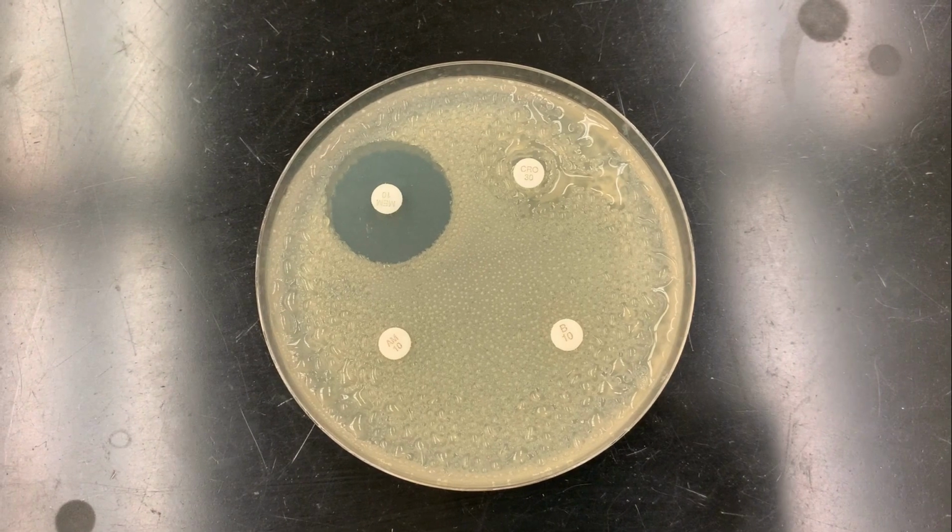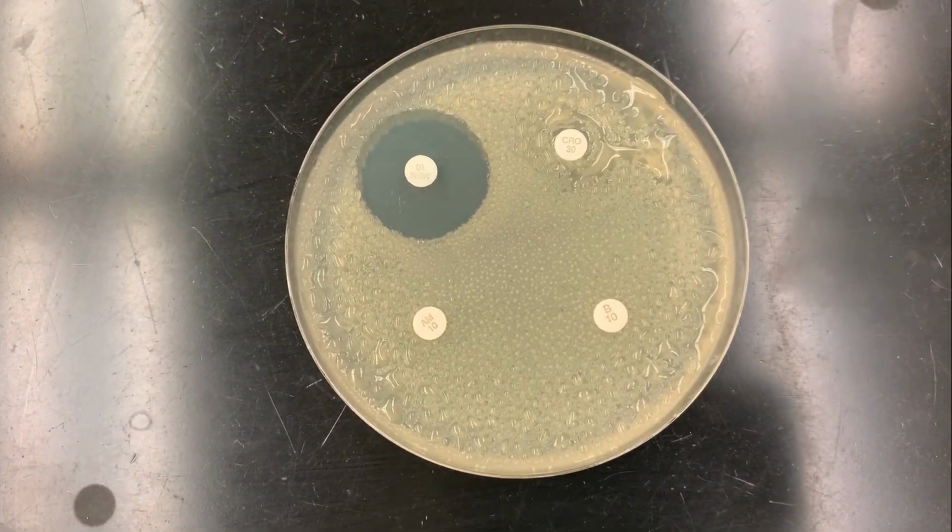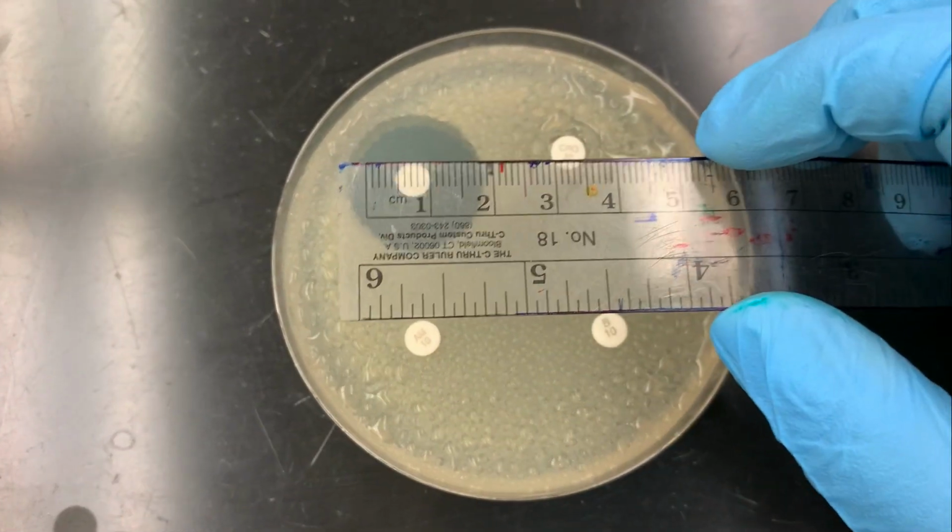So I'm going to take my ruler, and using, of course, the metric system, we always measure in millimeters when we're measuring zone of inhibition.